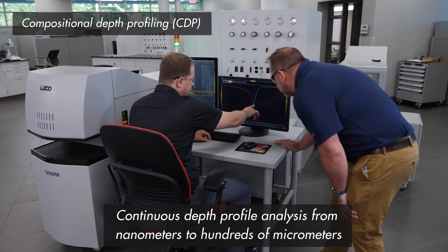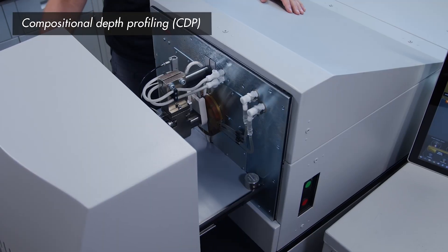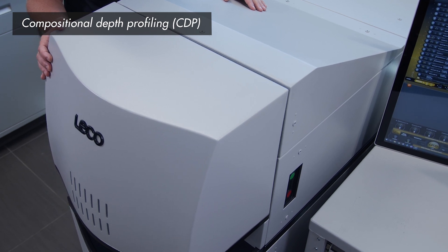All elements from the surface to the substrate are acquired simultaneously, providing the complete chemical composition within only a few minutes, increasing sample throughput while minimizing cost per analysis.